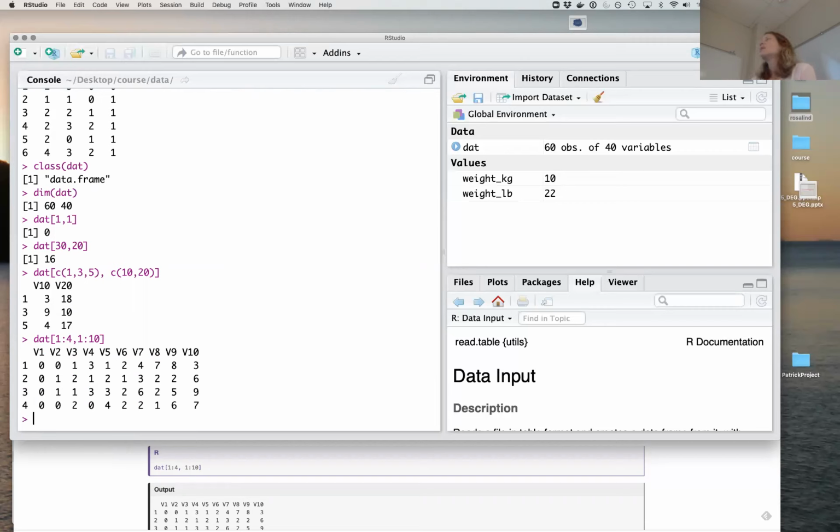For the most part, you don't need to be an R guru to use DESeq2. The manual is really detailed. It's going to tell you exactly what to type on the command line. There's just a few little things at the beginning. You've got to get your data loaded, and you've got to get your samples labeled the correct way with the right factors. So there's just this very little part at the beginning where you kind of have to know how to create a data frame and have values. But after that, you really don't have to know much about the innards of R. It's more about running the DESeq2 commands, very much like we did with the bash terminal. Just understanding the commands, changing the parts of the command so that they're relevant to your experiment.